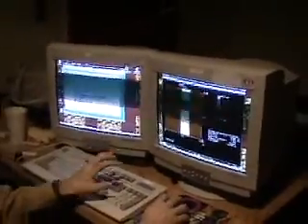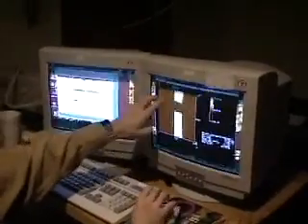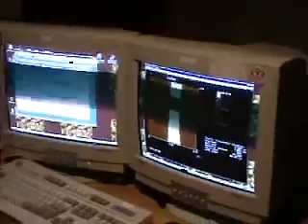So now I'm going to click clear to get rid of the boxes. Now you don't see this artificially raised place because it wasn't thrown off in its height calculations by these high places in the sample. So very often, especially if you have a big piece of dirt, you want to draw a box around it before you do the flatten to get the best possible image.